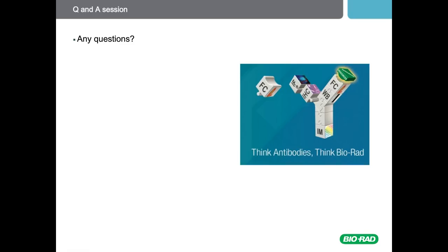The next question is, can I use frozen cells and how should I prepare them? Often you need to use frozen cells from a tissue if you can't do all of your analysis in one go, and it's quite feasible to do this. What you need to do is harvest the cells from the tissue with your usual method, whether it's mechanical or some kind of enzymatic digestion.